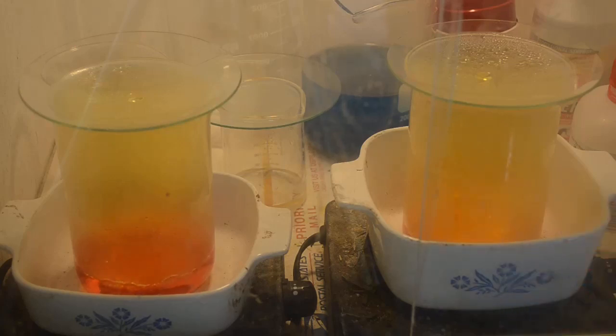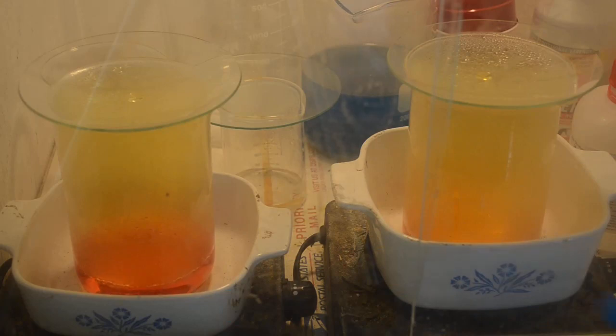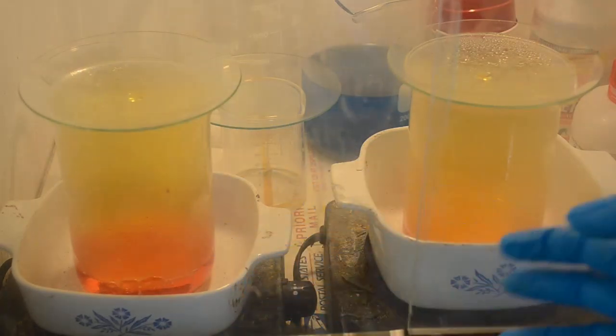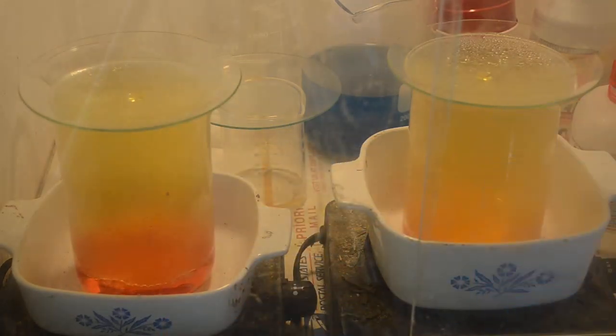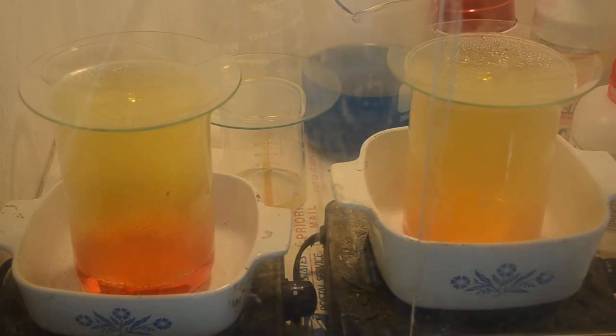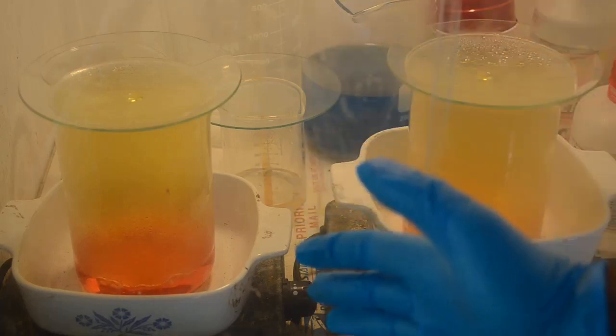I've got two solutions in the fume hood here — they're both just aqua regia. There's no gold dissolved in either one. Believe it or not, that's the color aqua regia turns even when you haven't dissolved any gold in it. It's just muriatic acid and nitric acid, and I've warmed them up so there's a little bit of boiling going on, the nitric acid boiling off a little bit. We'll pretend these solutions have gold in them — say two or three grams dissolved — and I want to get the gold back.